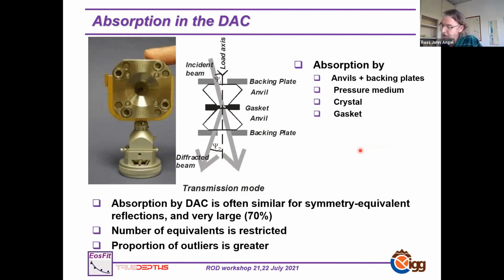As a consequence, the number of equivalents is restricted, and the symmetry equivalent reflections may not give you a good control on what the absorption corrections are.